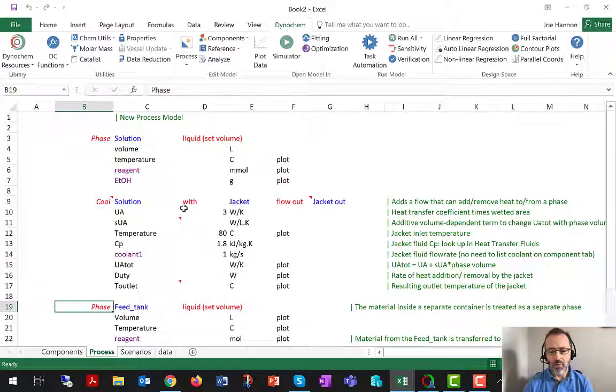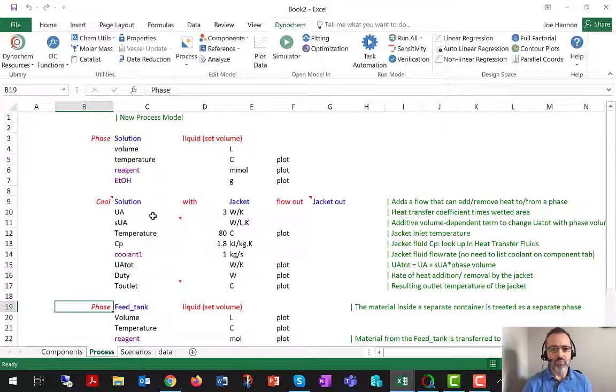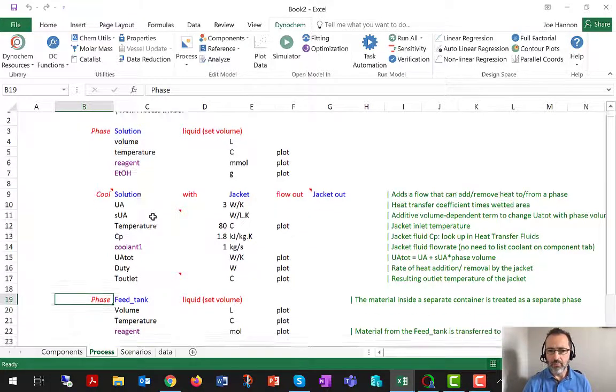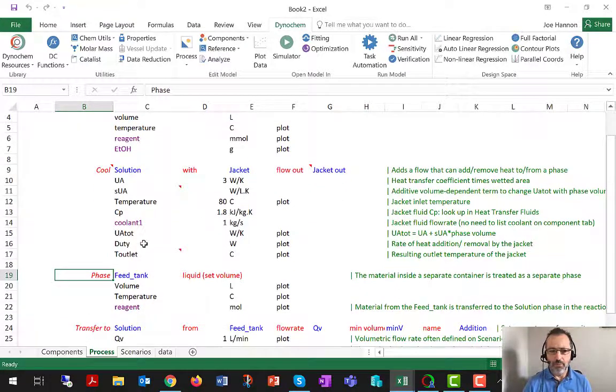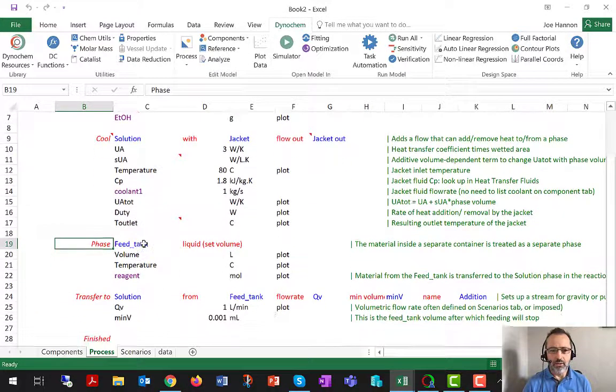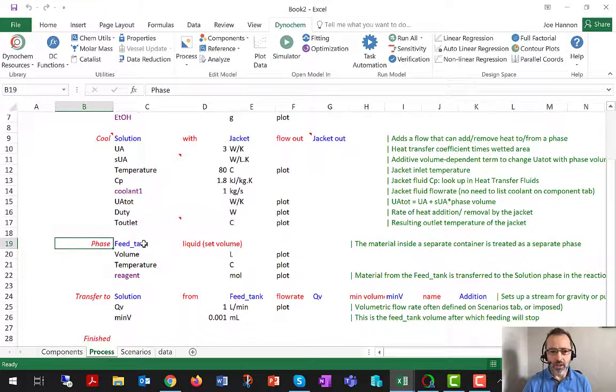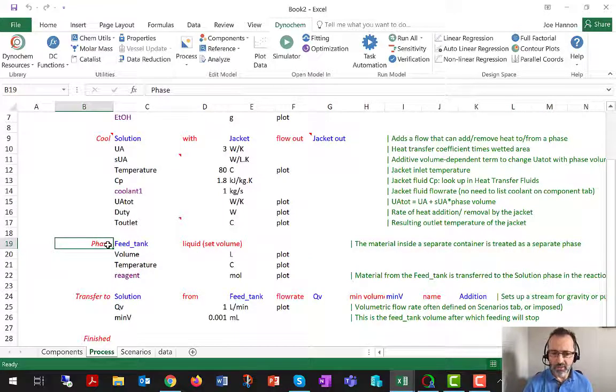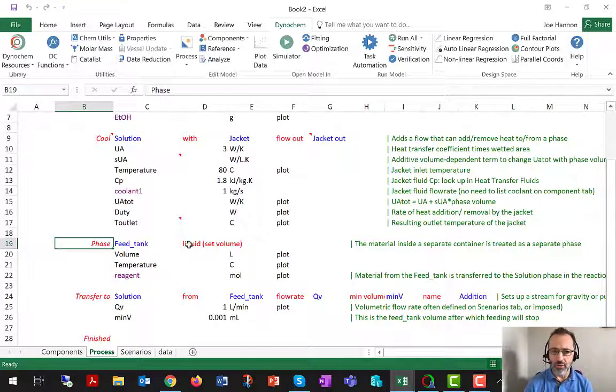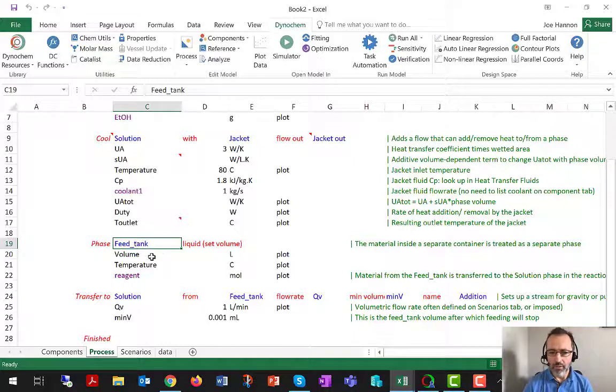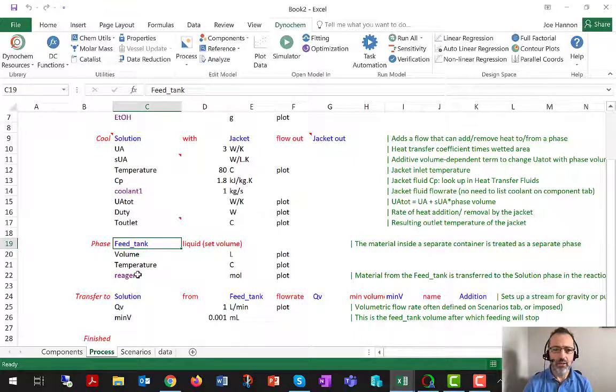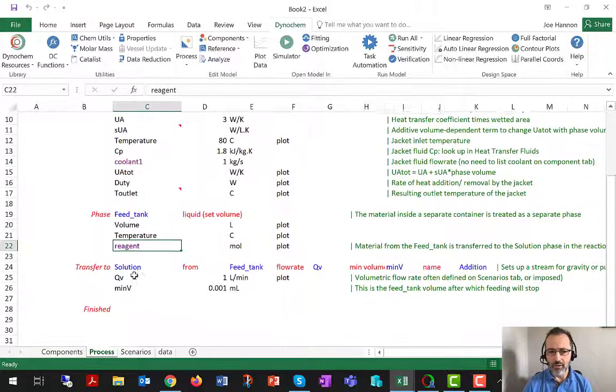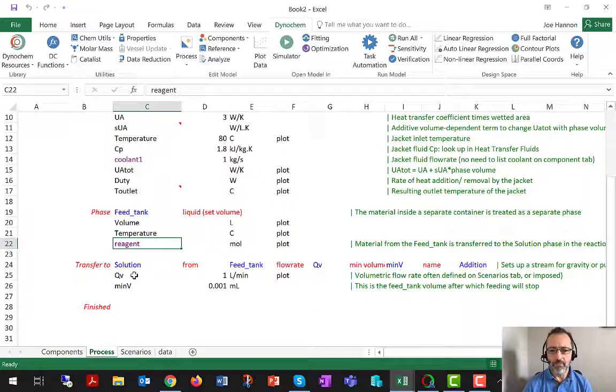You might be getting the hang of this by now. This is going to extend the process sheet and add more paragraphs. We're going to see some red keywords like phase and liquid, some blue ones like feed_tank, more violet ones like reagent.